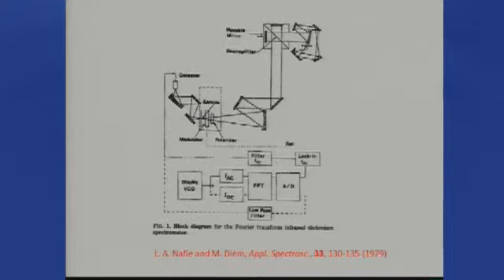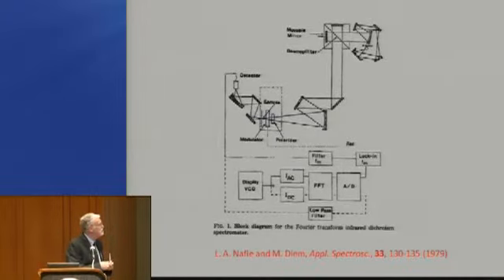And basically the setup, as we've all seen, coming out of this paper was that the beam from an FTIR spectrometer was scanning relatively slowly, was passed through a linear polarizer, through the photoelastic modulator, and then onto the sample, and then you could split off the VCD and the regular spectrum, but the VCD spectrum was measured at a modulation frequency which is way higher than the Fourier frequencies of the FTIR spectrometer.